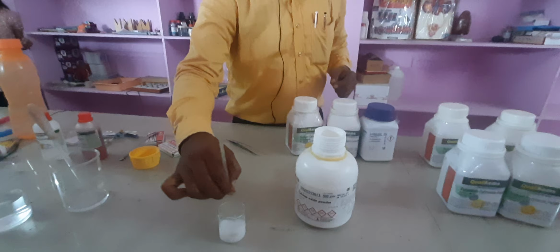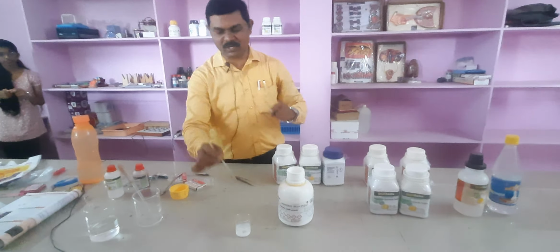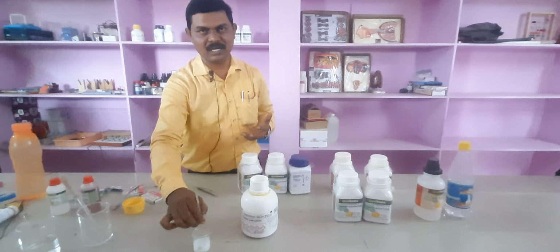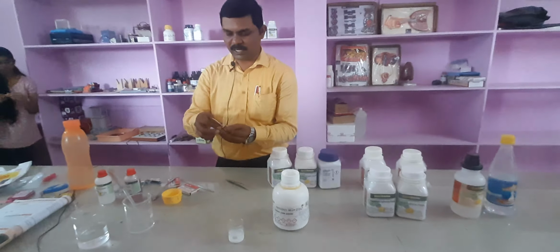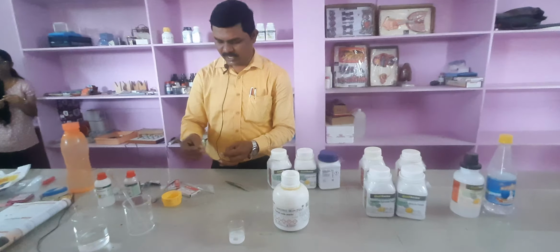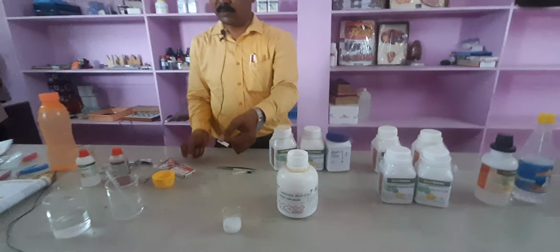So can anybody say what new product is produced here? Calcium hydroxide is the new product. Calcium oxide dissolved in water produces calcium hydroxide. What is the nature of this calcium hydroxide? This nature is tested by red litmus paper. If you dip the red litmus paper in it, it will turn blue. Okay, let us see now whether our experiment is successful or not. If it turns the red litmus blue, this is calcium hydroxide, which is basic in nature. So let us see now.